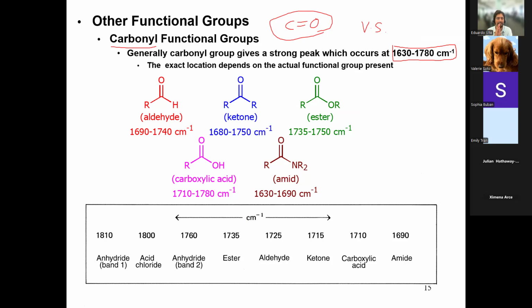And I want to emphasize this is not absolutely 100% always the case. This is just guidance, right? Just like if you go to Mexico, you might have some tacos, but that doesn't tell you if you have al pastor tacos or carne asada tacos or cabeza tacos, right? There's many types of tacos, even though they all use tortillas. Well, there's many types of carbonyl functional groups, even though they all have carbonyls. And yeah, generally you can find them in these regions, but if you go to Tijuana, they'll splatter it with a whole bunch of guacamole, right? Each one has its own little regional behavior.